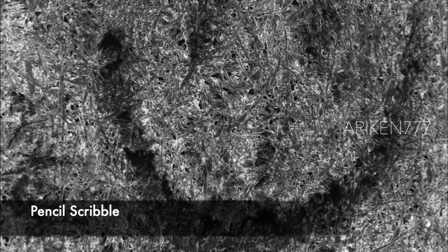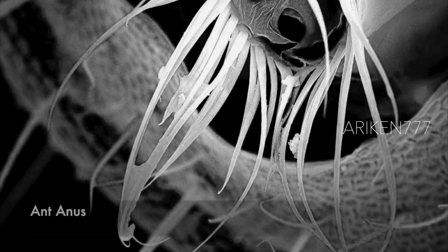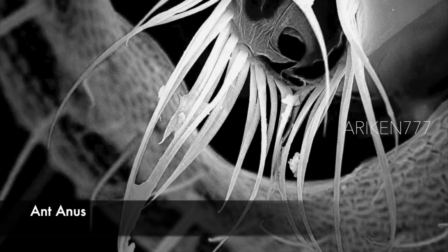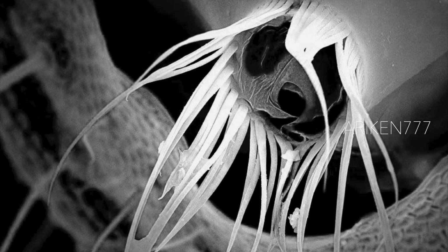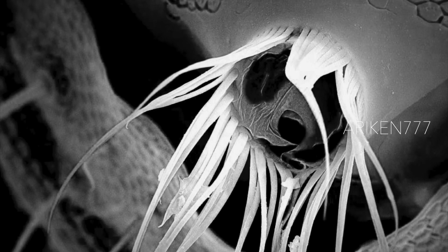A pencil scribble. An ant's anus. Ants excrete bodily waste through a single orifice, their anus, which is located at the tip of the abdomen.